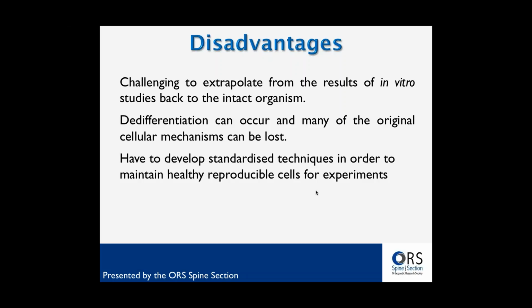Now, the other disadvantage is that we have to develop standardized techniques in order to maintain the cells healthy and also reproducible for the experiments. Most people in different labs feel that they have developed certain standardized techniques, and then we start comparing the results from one lab to another, and yet the techniques they used are quite different from what were used in other labs. This does create a discrepancy, and it's something that we should look out for in both the literature and also in our own experiments.